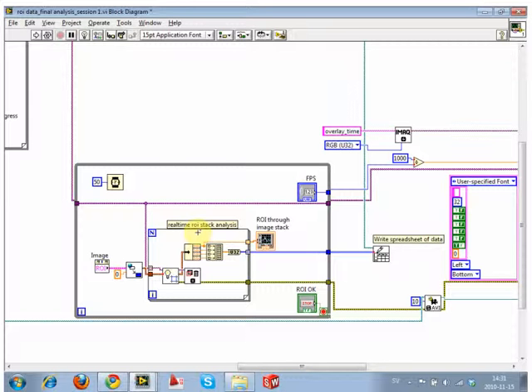In here we actually don't set any hard numbers. We're not saying do 10 images or do 5 images. We just say do as many images as you find. And it didn't find any, so it wouldn't do anything. If we set a hard number in there and say do 5 images, then it would fail and say there's an error, because there aren't 5 images. It can't run 5 times because there's nothing there.